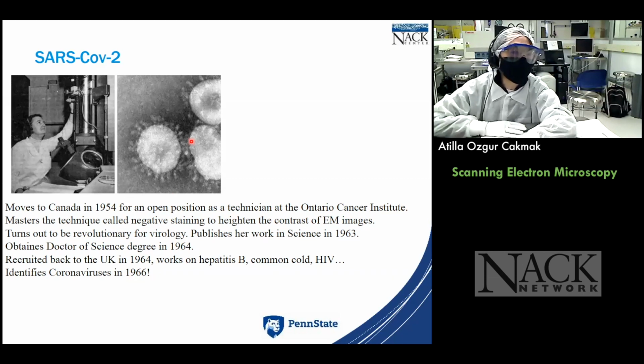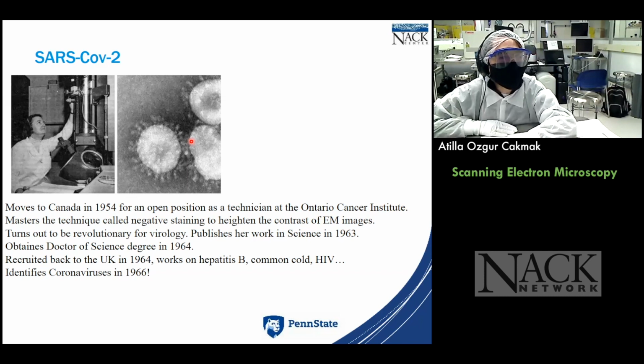But the funny thing is, when she sent this for publication, the reviewers said, "Oh, you're mistaken. This is just influenza virus, common cold, but you got a bad image under electron microscope." So they rejected her idea at first.